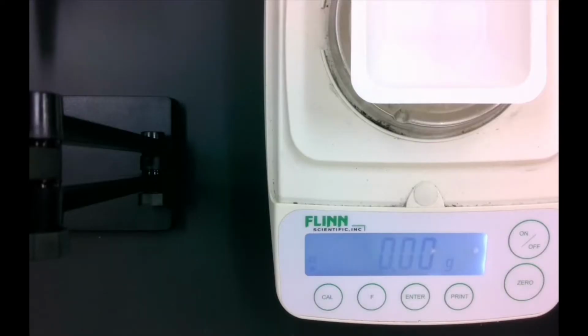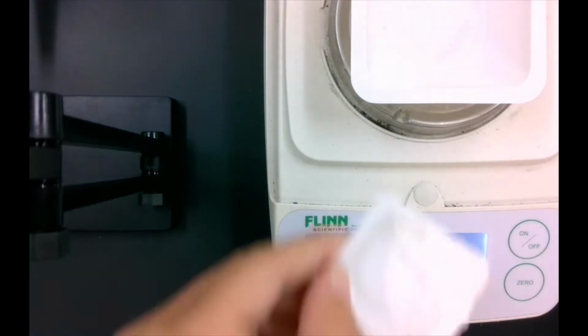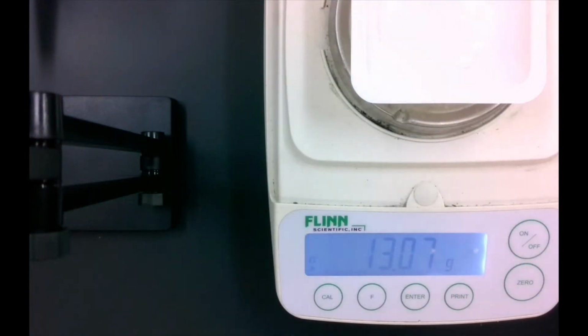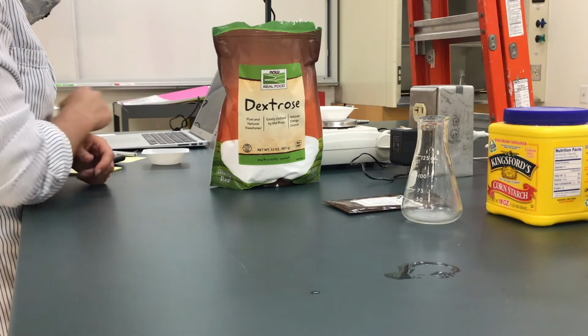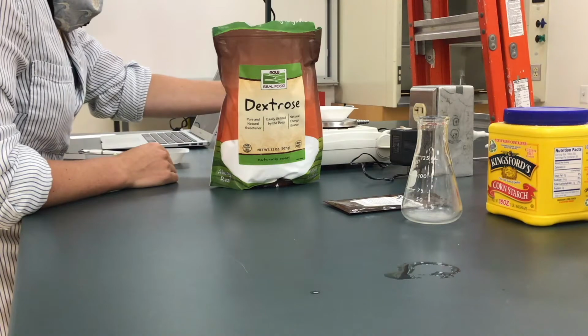So I'm going to zero my scale, and that's about 13 grams. I don't need to be super precise because this isn't chemistry, but we have about 13.6 grams. So I'm going to set that aside as our measured glucose.